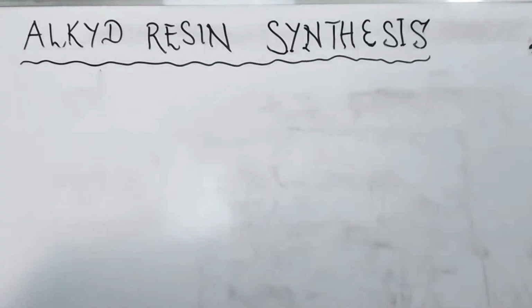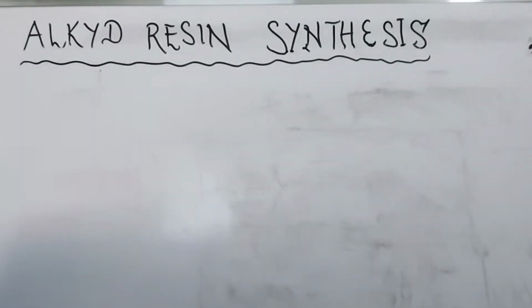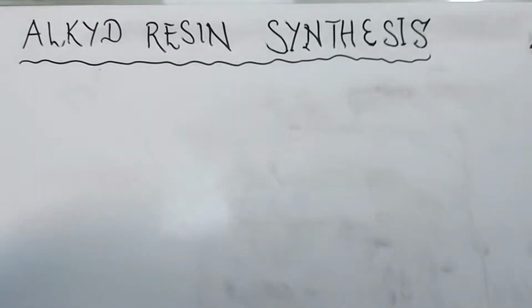Today I'll be explaining the criteria, the parameters behind the Alkyd resin synthesis, which I've uploaded previously. If you're new to the resin synthesis, you could refer to my other video and get better insight, because today we'll be focusing on the calculative aspect of the Alkyd resin synthesis.